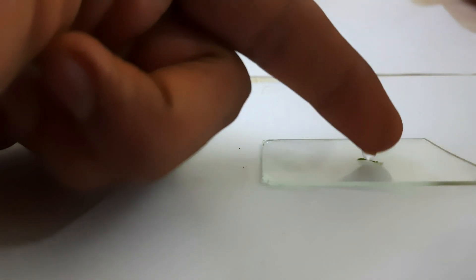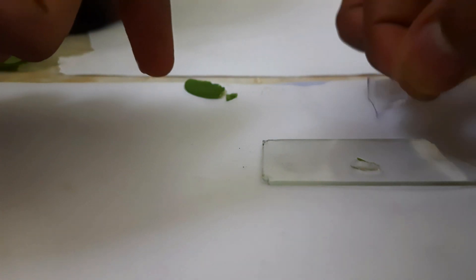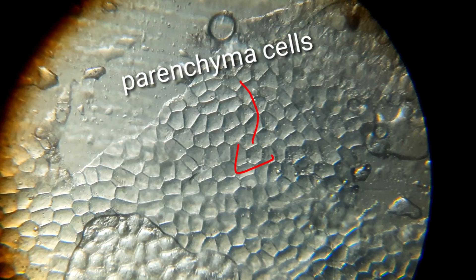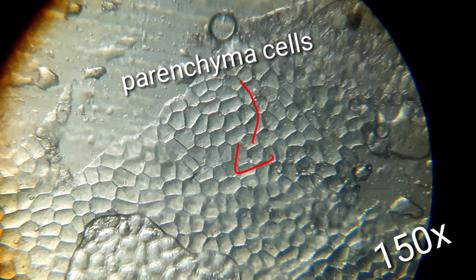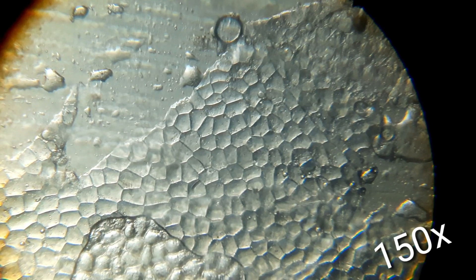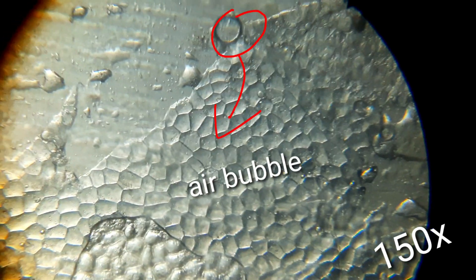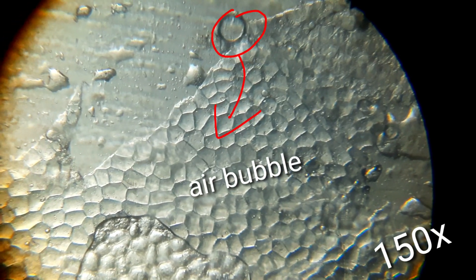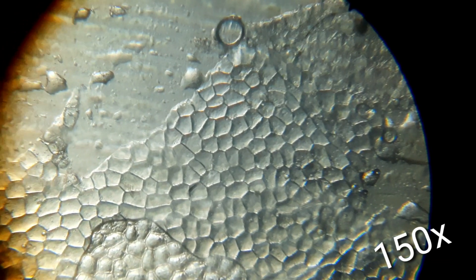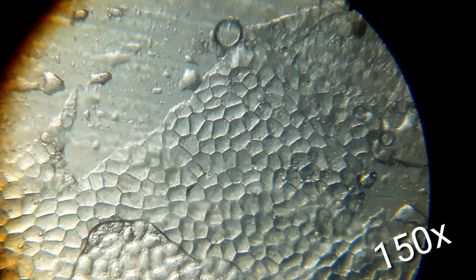We've got a drop of water over it. Starting with 150 times magnification, this is what I was able to view — some irregular structured cells, which are the parenchymal cells. The making of the slide was not that clear, and as you can see there are also some air bubbles as well as some other debris.